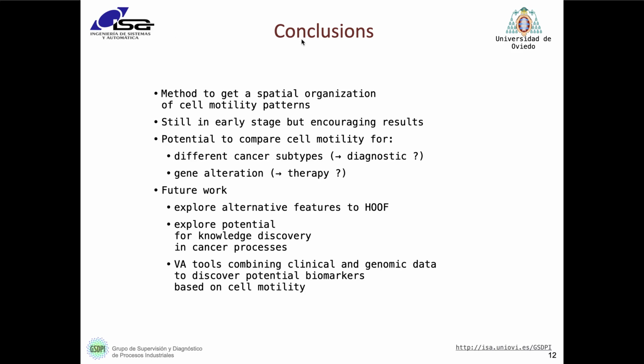As concluding remarks, we have proposed a method to get a spatial organization of cell motility patterns that can be used in visual analytics applications. The method is still in an early stage, but has given encouraging results for further developments.